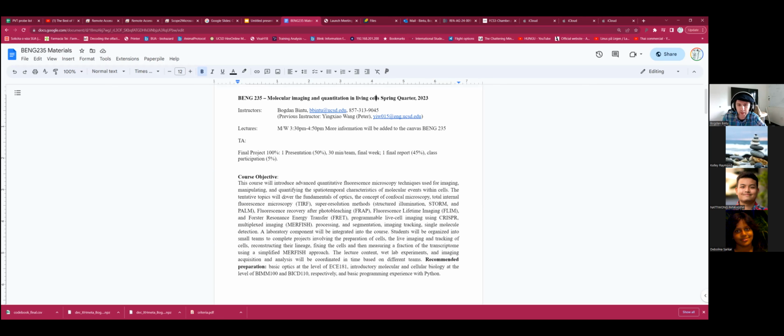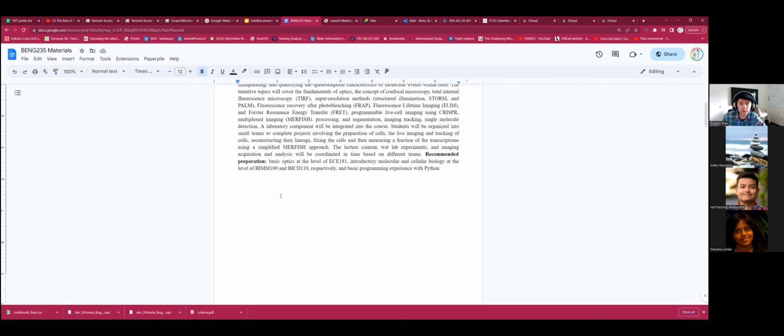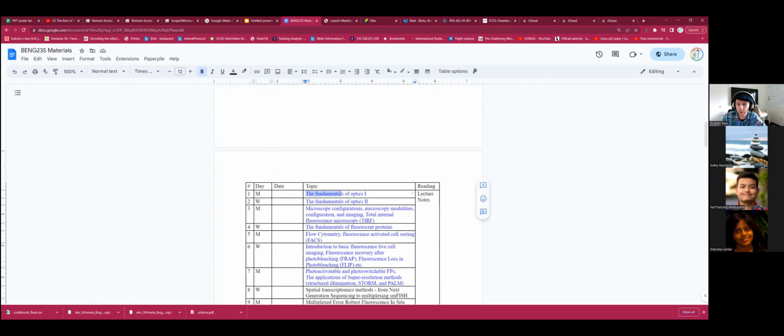So the course is going to have a few objectives in terms of what it aims to achieve. One of the first things that would be useful is to get everyone up to speed with some of the basics of imaging. Maybe it's even more obvious if I look at roughly what topic we're going to cover almost lecture by lecture. So we're going to talk about some of the fundamentals of optics. I want to make sure that at the end you'll know what a lens formula is, what diffraction roughly is, and some of the basic properties that are essential for anyone doing microscopy to know.